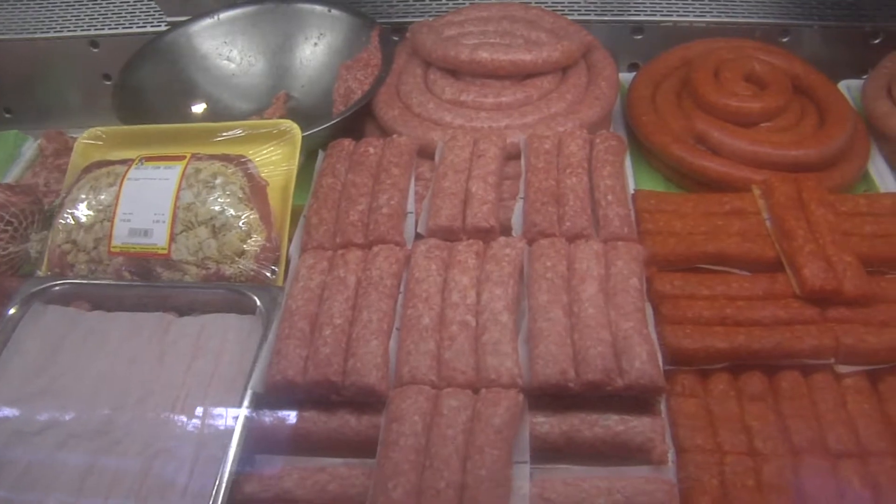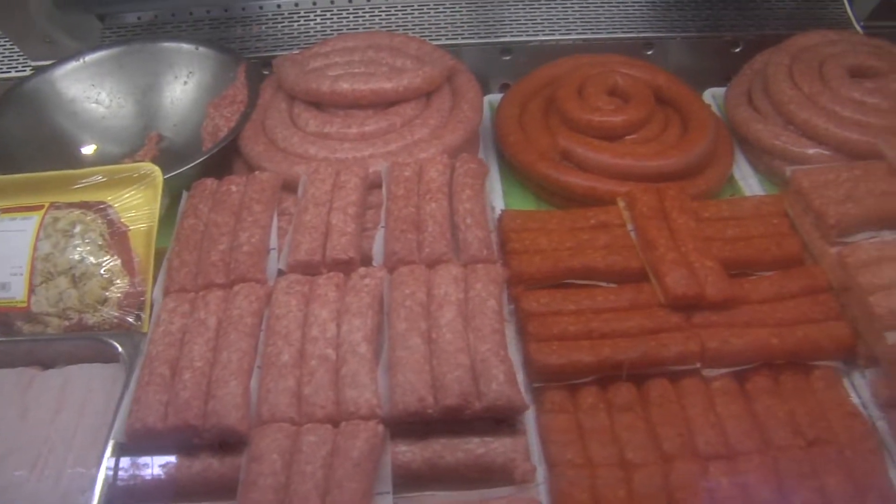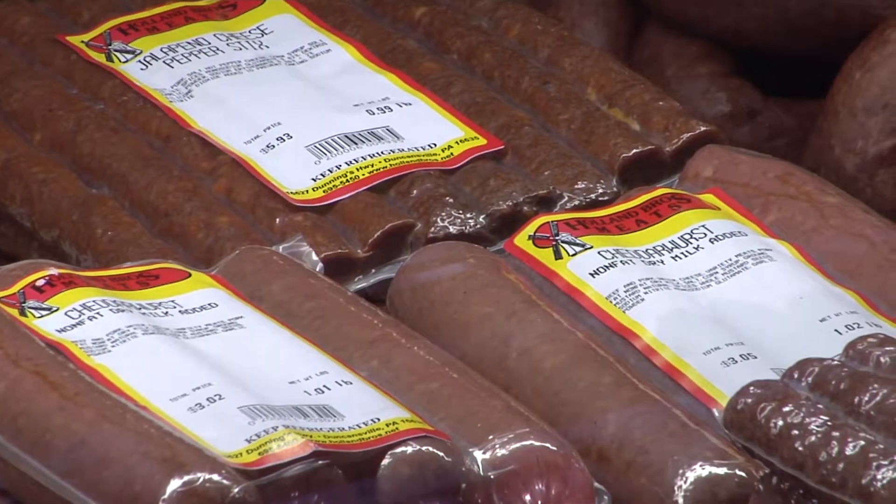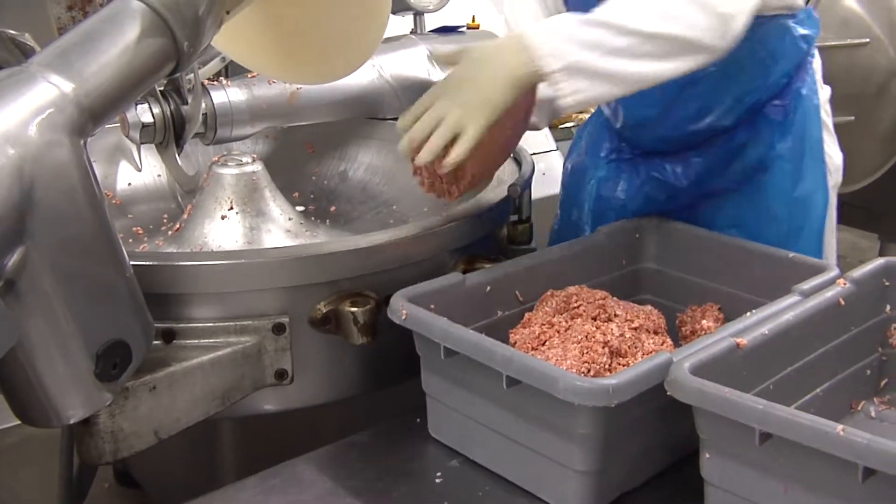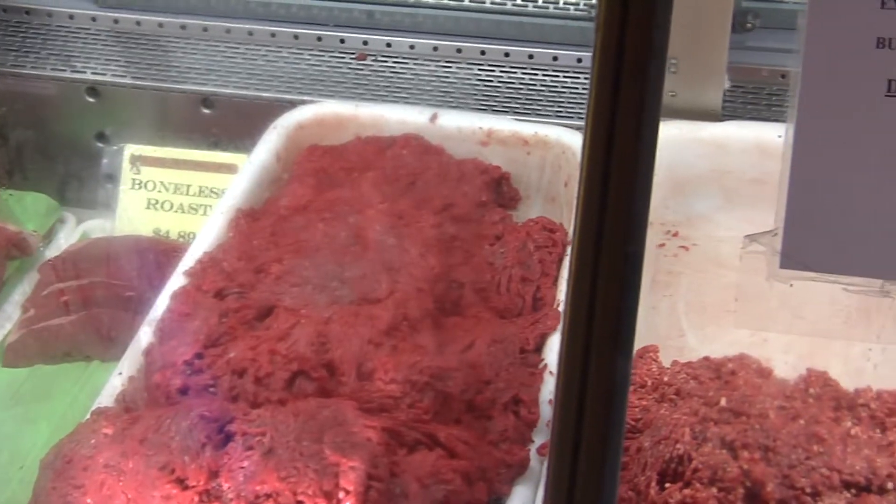Whether processing uncooked meat products, such as raw sausage, or cooked meat products, such as hot dogs, a clean environment is necessary for the product to achieve the maximum shelf life.